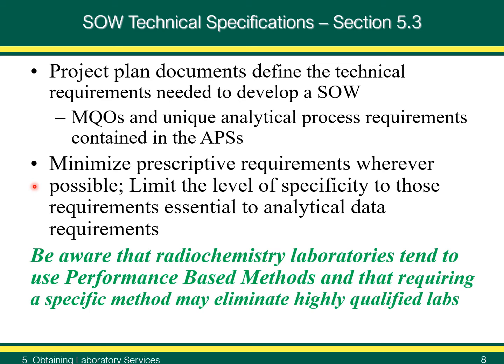Let me repeat what I said above. MARLAP recommends against requiring specific radioanalytical methods unless methods are prescribed by regulation. Consider that a project may be raising its risk by specifying a particular method in an SOW APS. All too often, methods are prescribed for use beyond their scope and applicability. For example, drinking water methods are too often prescribed for solid matrices.